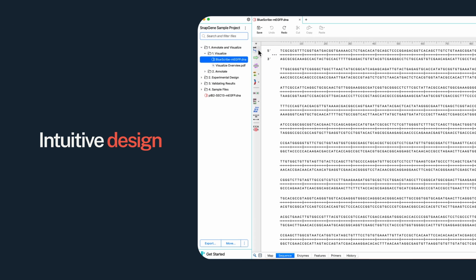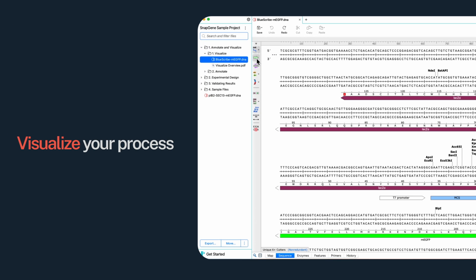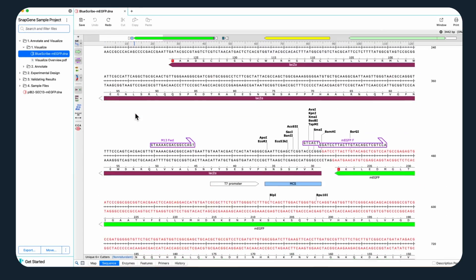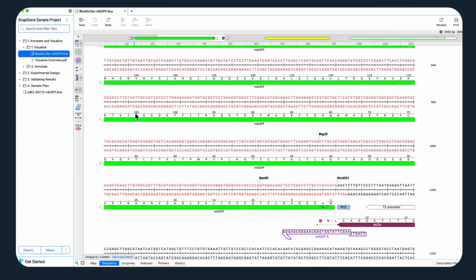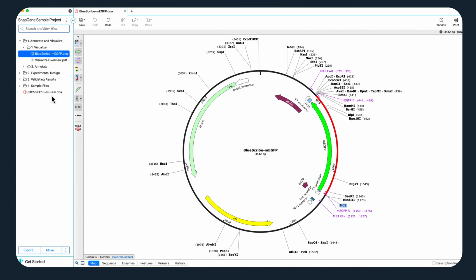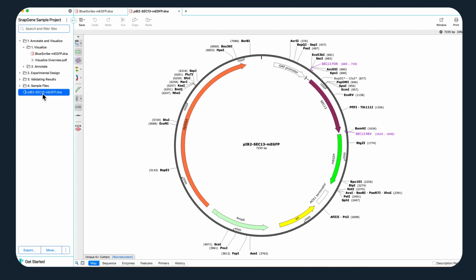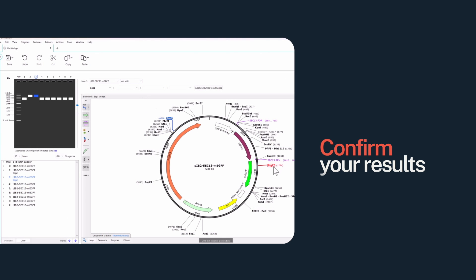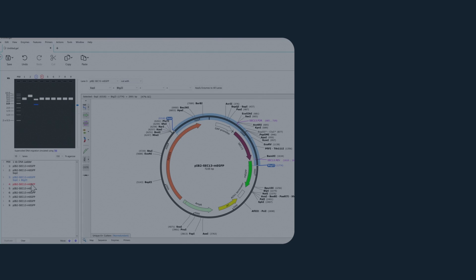SnapGene's intuitive design offers unparalleled visibility into your work, simplifying often complex tasks. View detailed DNA or protein sequences, browse richly annotated plasmid maps, and confirm your results with highly visual alignments and realistic agarose gel simulations.